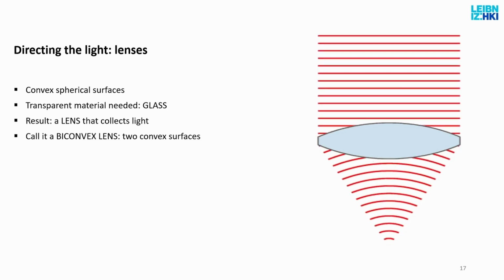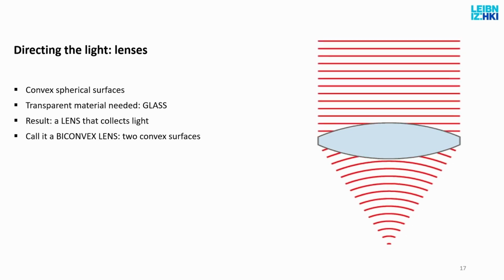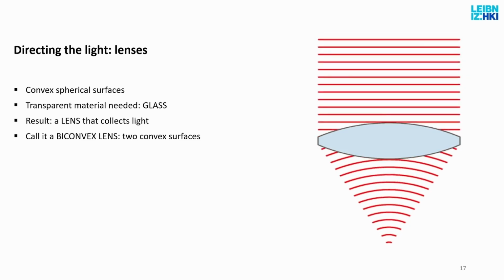So what I can do is take, for example, the sunlight, which is pretty much a parallel light beam, the sun being so far away. If you put your eyeglasses in the light path, or the sunbeam coming through the window, then you will see that the sunbeam, which was originally the size of your sunglasses or your reading glasses or your long distance glasses, will be concentrated in one point.